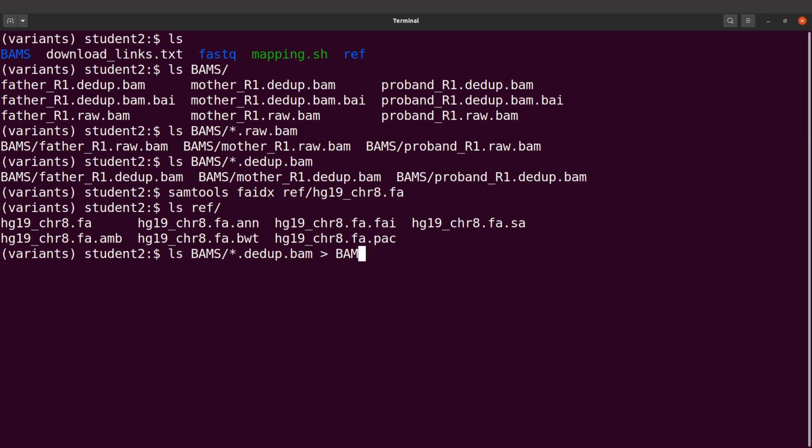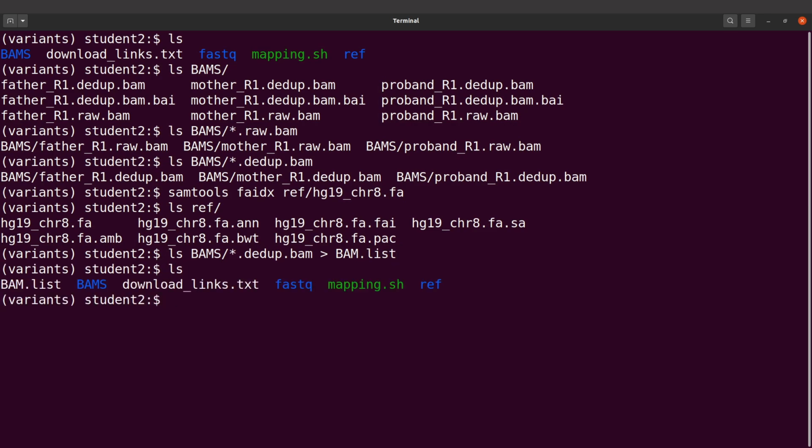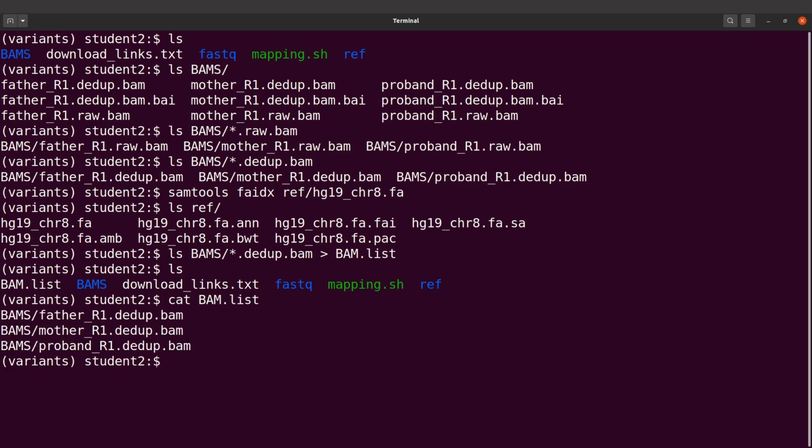So I'll say bam.list. Now if I do an ls, I'm going to find the bam.list file here, and then I'll say cat bam.list to display the contents. So I have them here.